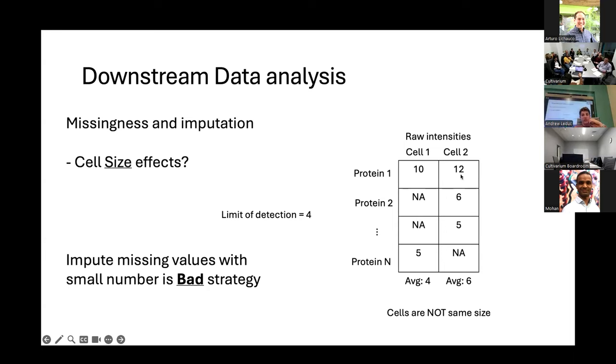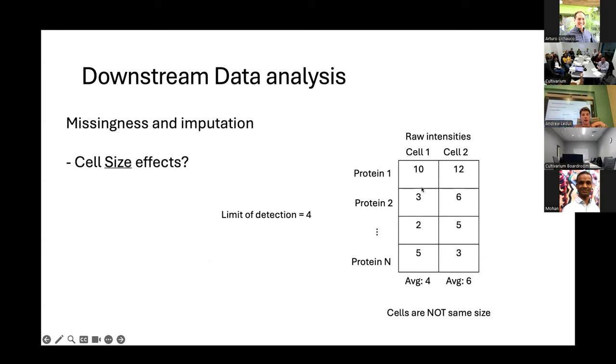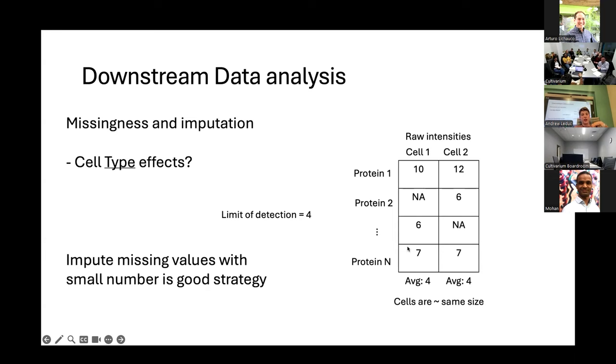The other thing which I prefer more than both of those is just looking at the analysis on pairwise observations that are shared between the cells, and that also has its own downsides. If you want to correlate these two vectors, actually 10 and 12 are the only ones paired here, but here I could just correlate 10, 7 to 12, 7, right? Mm-hmm. And that would be excluding things where one of them is missing. This is also an option. So there are a lot of options, and it's not one size fits all. There are a lot of considerations.